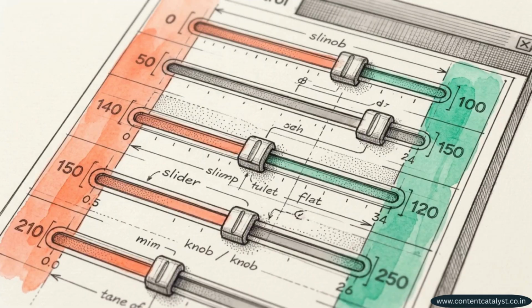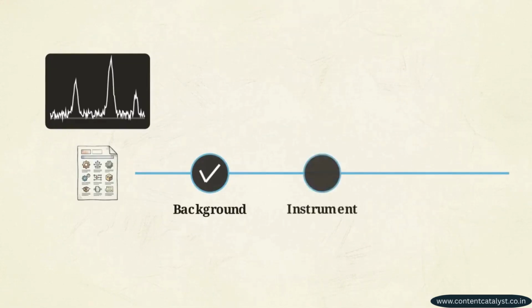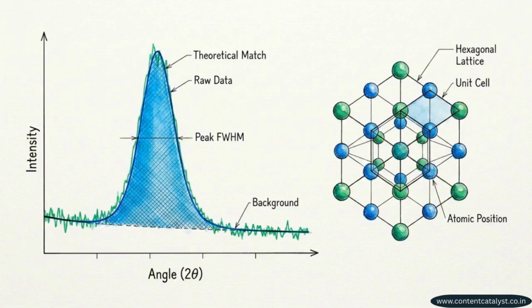Its entire interface is designed to enforce strict, systematic physical constraints on the data you are fitting. It exists to give researchers a fully auditable trail. You start with a raw, noisy scan, and through applied physics, arrive at a chemically sound conclusion.